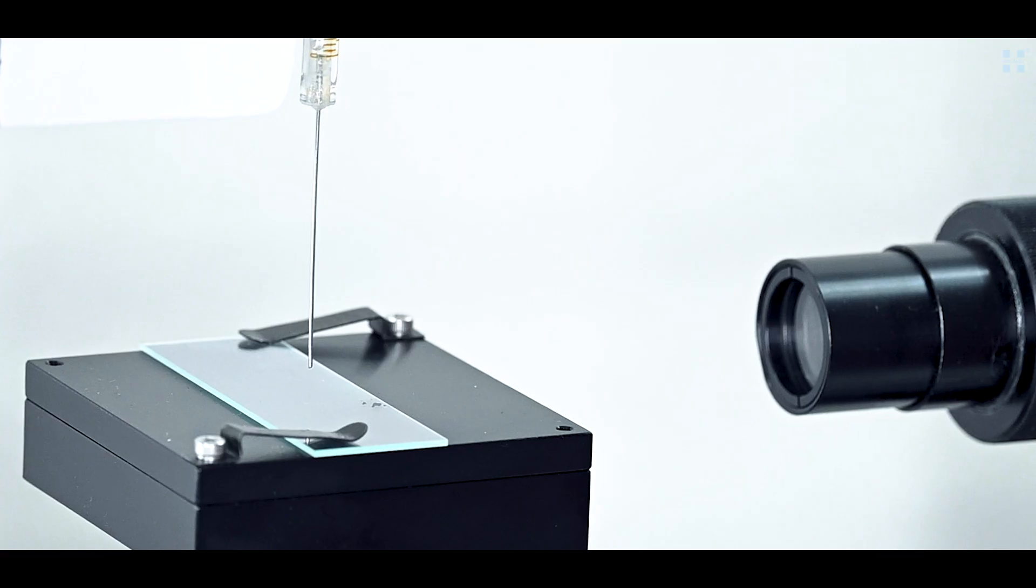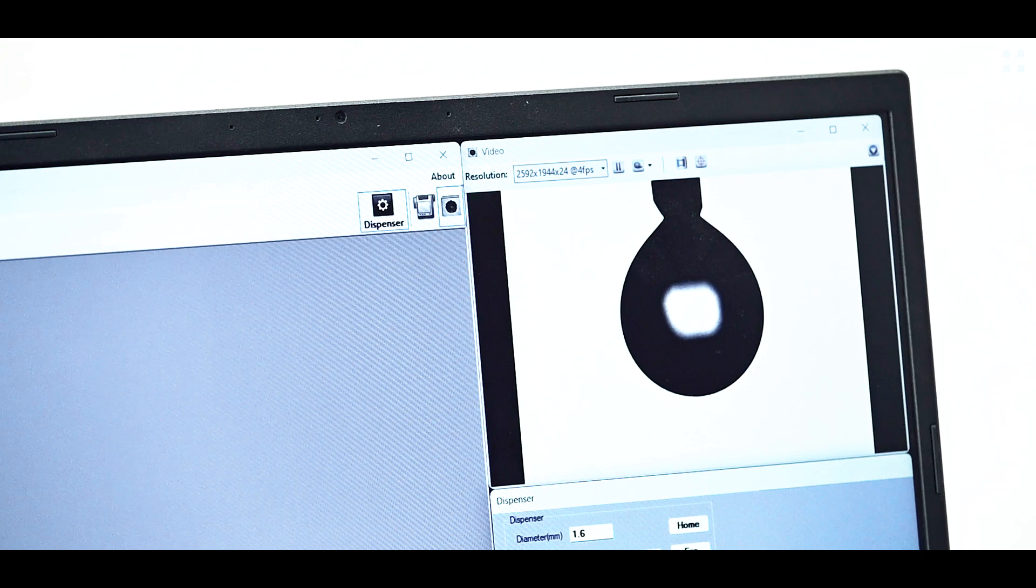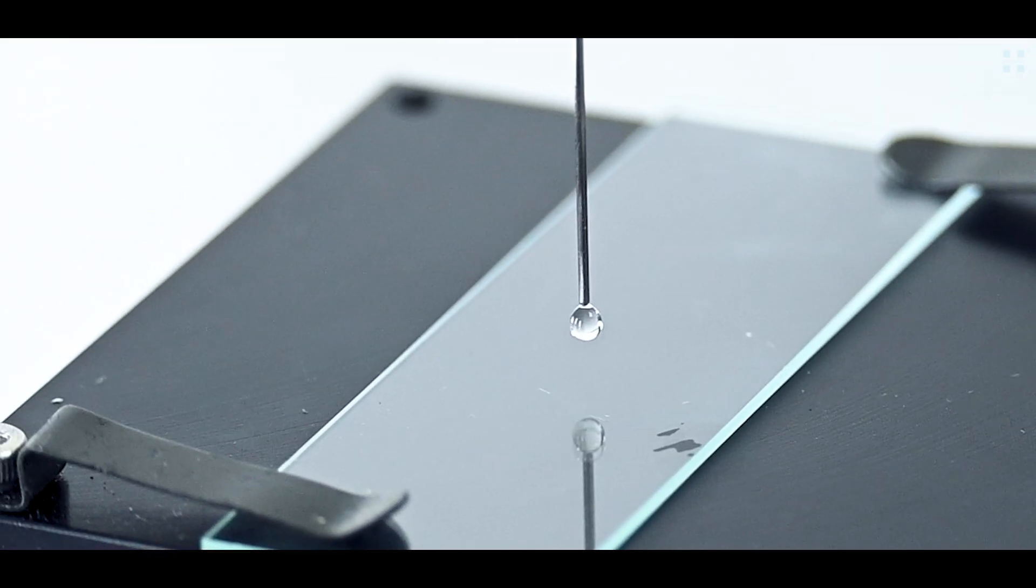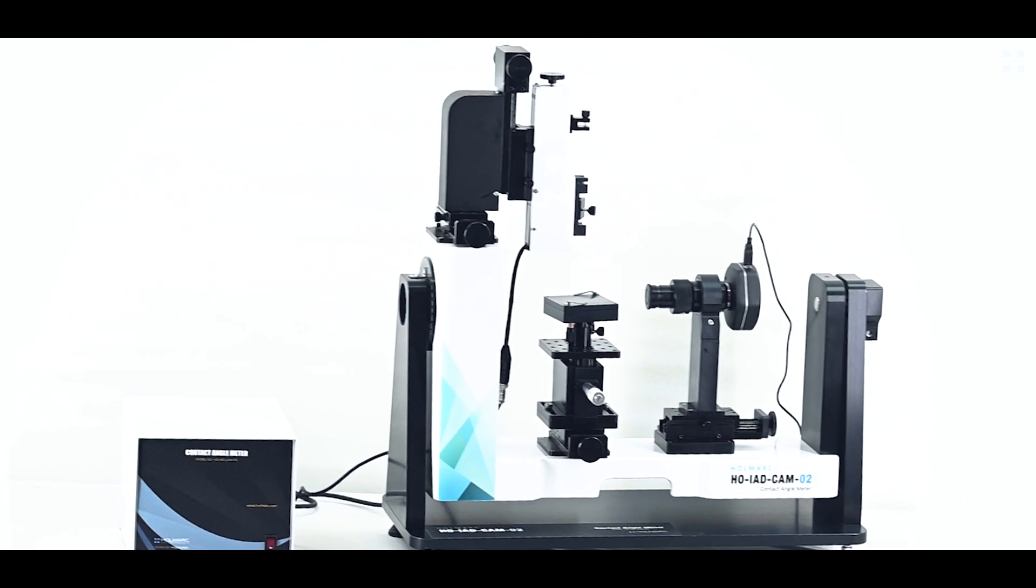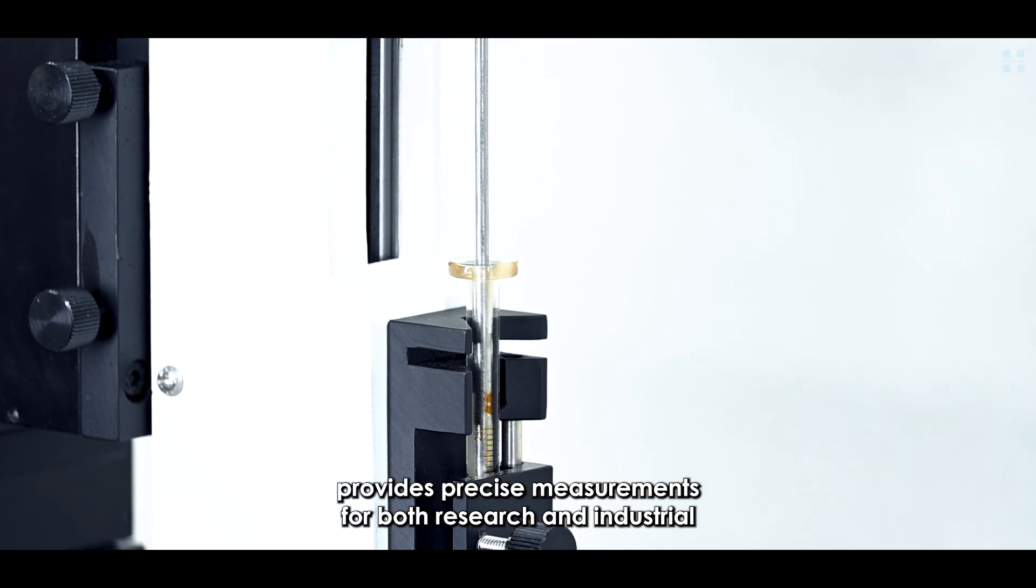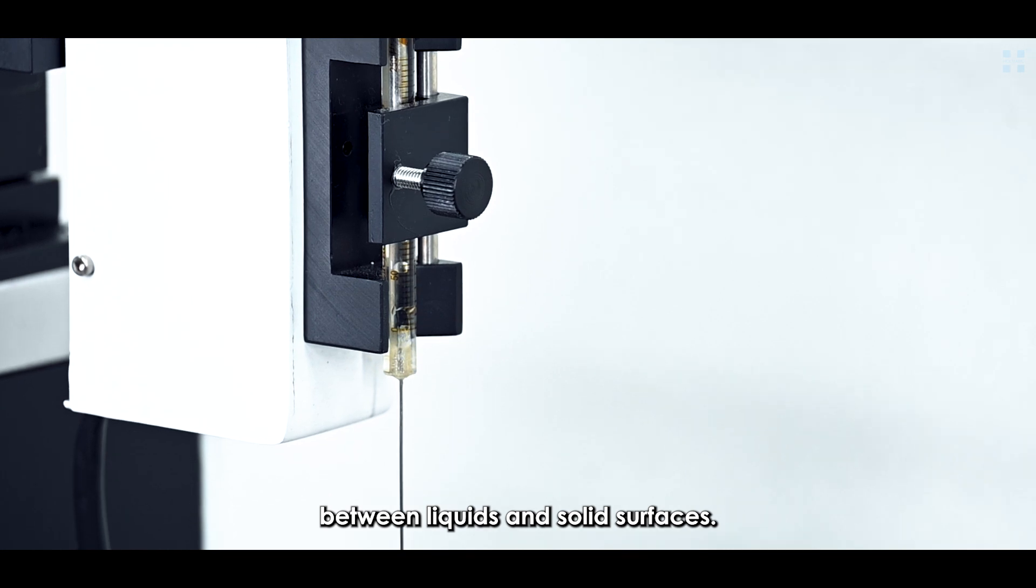Holmark's Contact Angle and Surface Tension Measurement Device, model HO-PHIAD-CAM02, provides precise measurements for both research and industrial applications, offering valuable insights into the interaction between liquids and solid surfaces.